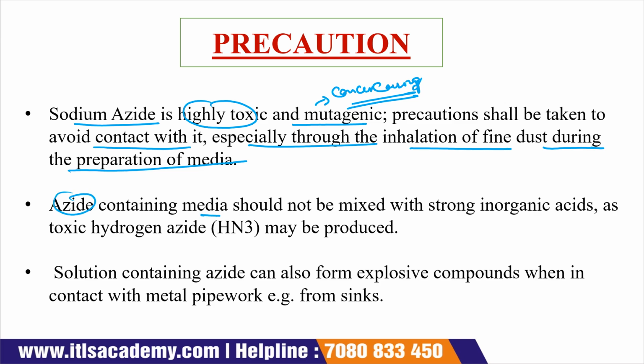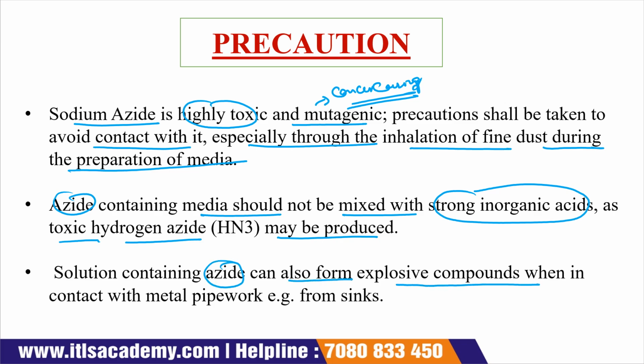Media containing azide should not be mixed with strong inorganic acid, as toxic hydrazoic acid may be produced. Solutions which contain azide can also form explosive compounds when they come in contact with metal pipework, for example from a sink. So this is all about the detection of enterococci.